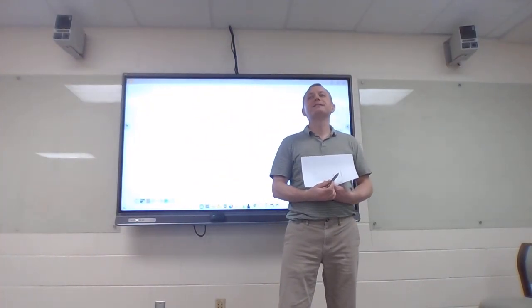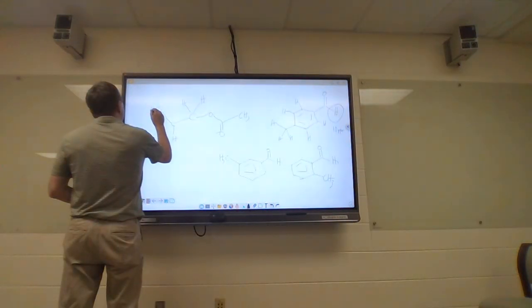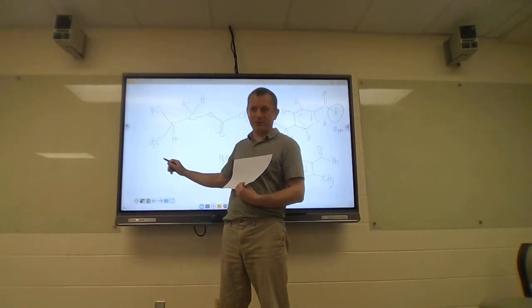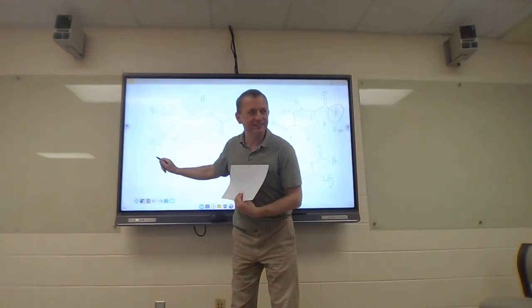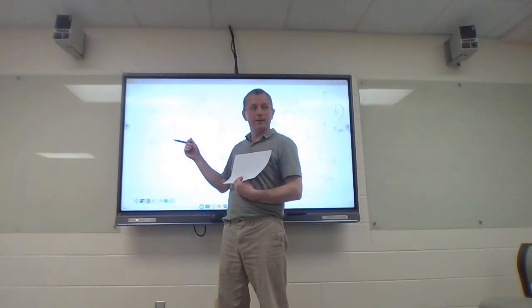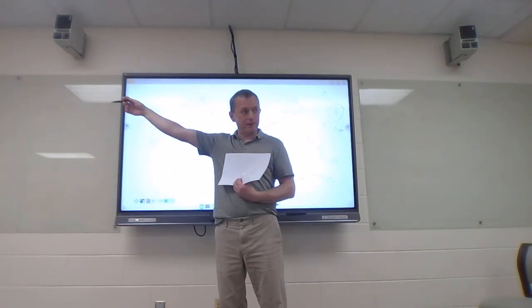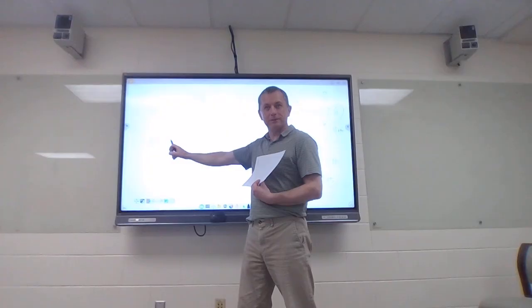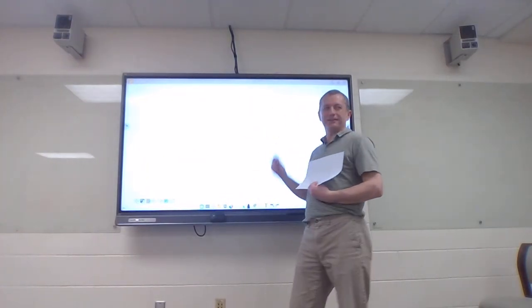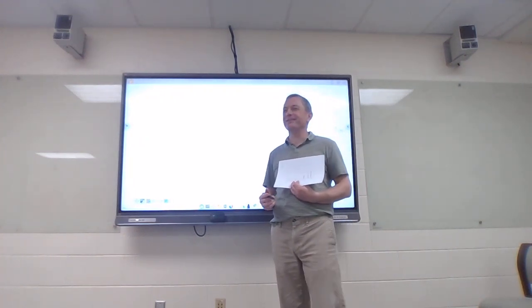Without symmetry, you can't. 2 methyl groups that are identical now give me 6 total hydrogens. And look at their shift, right? So we expect them to be all the way over there. And where was this 1? Underneath that singlet. You see how NMR can get tricky pretty quickly, right?